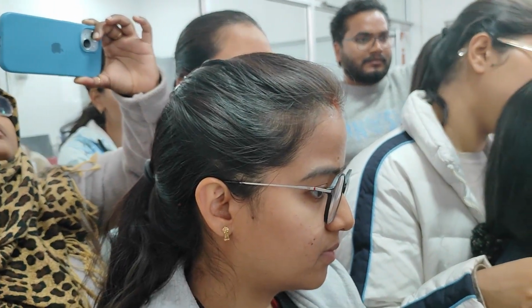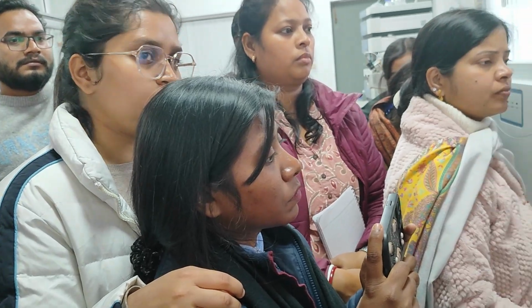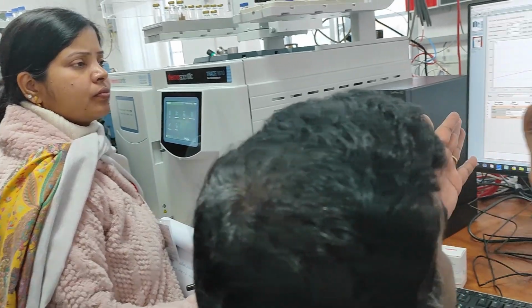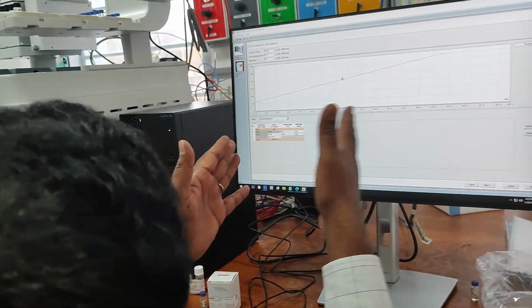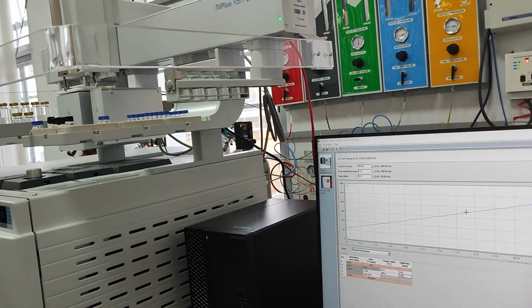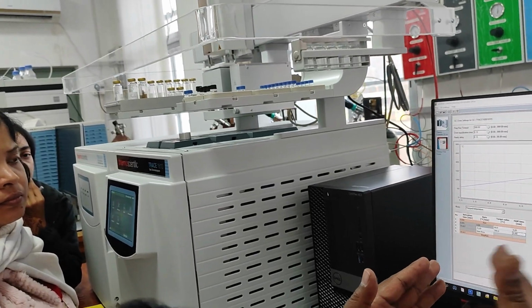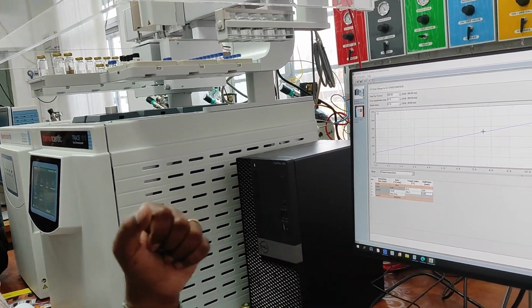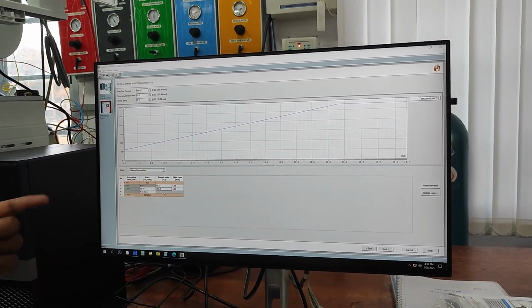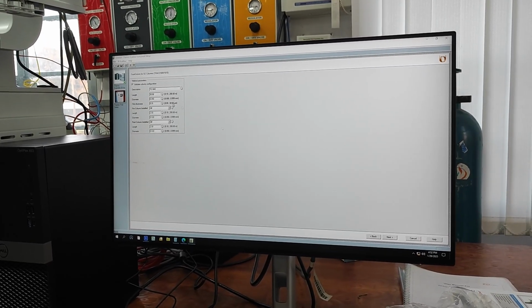So accordingly, for the temperature zone and timing, wherever you have more compounds in a short temperature increment, you have to reduce the incremental rate, so that there is sufficient time to separate the molecules. Then wherever you have a limited number of compounds and a wider temperature range, you can slightly increase the ramping. So this is a slightly skilled job, depending on the molecular separation. You can set up the program. Now I'm just going with the simple one, because I have only 1 or 2 standards.